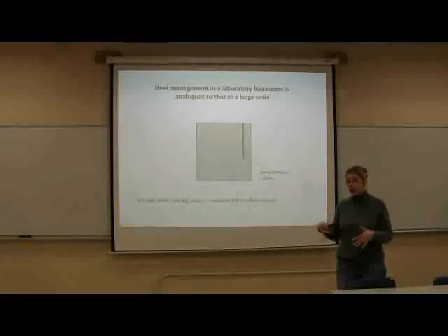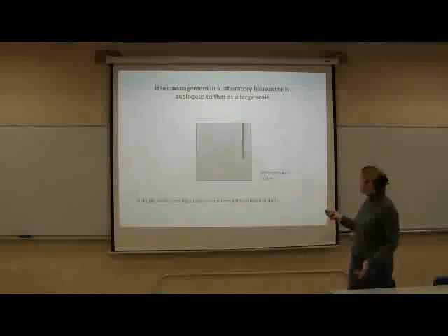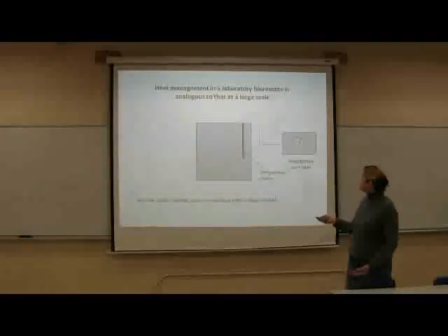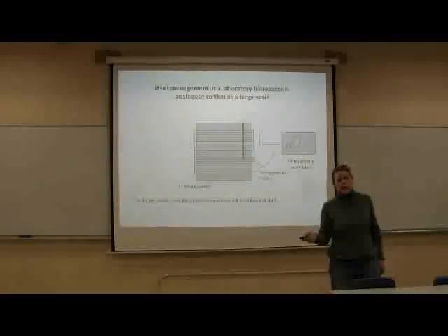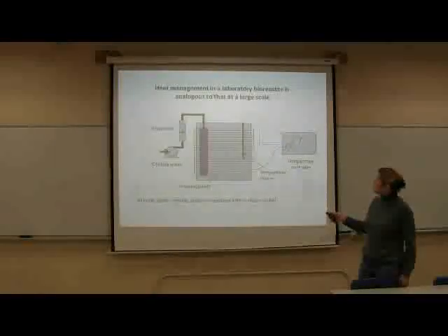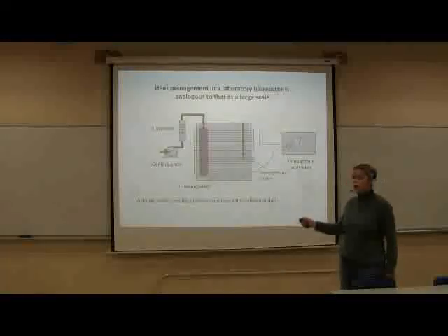There's just a different shape of the heat exchanger. We use a temperature probe inside the bioreactor, and we have a temperature controller, just the same. We use a heating jacket to heat up the outside of the bioreactor, and we also are going to use a little, pretty much just like this, a cute little heat exchanger inside of our bioreactor.